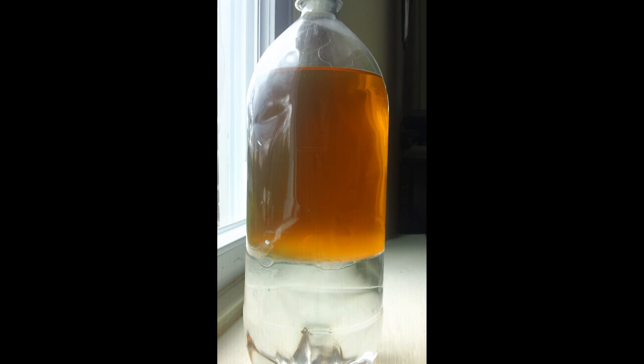What we have here is a sample of biodiesel that's already gone through two water washes. This is the third wash — you can see the water at the bottom is very clear. The fuel is clear as well, though still a little cloudy because there is some residual water that has not settled out. When it sat in the sun and got some solar heat, it cleared up quite a bit.